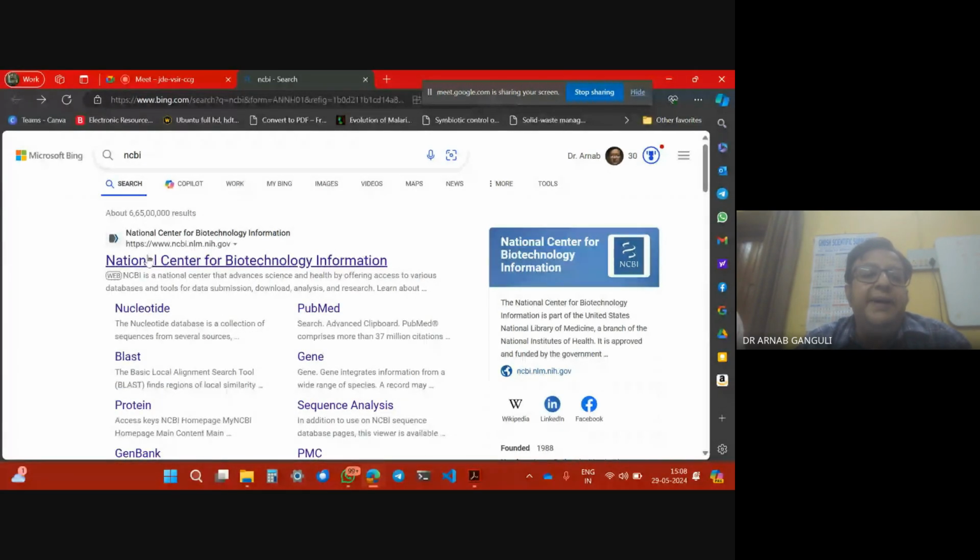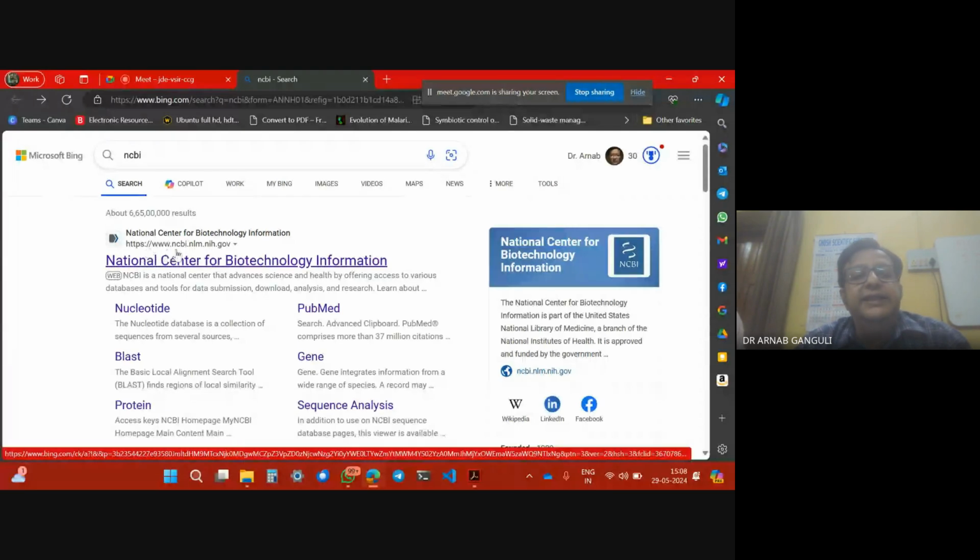And the web address is ncbi.nlm.nih.gov. It's there in the practical notebook. Only, what we will do today, I will take screenshots and I'll send them to you for your practical book. You did not follow your seniors' copies.